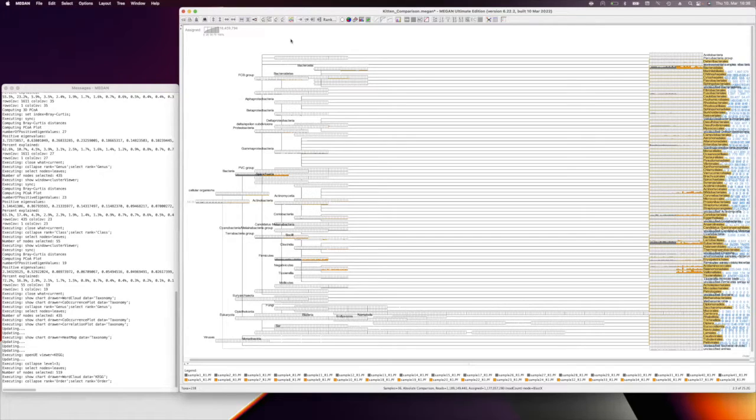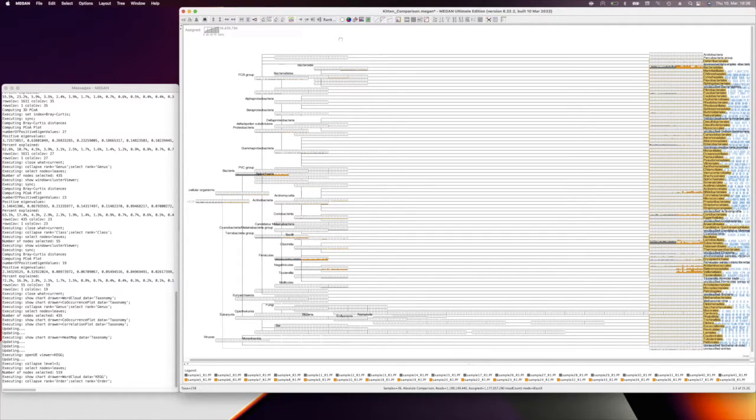You may want to deselect them, and you write a MEGAN script that deselects all taxa in your different data sets and then performs your analyses. But where this is really useful, in my opinion, is when you want to modify or export data. And I will show you what I mean.